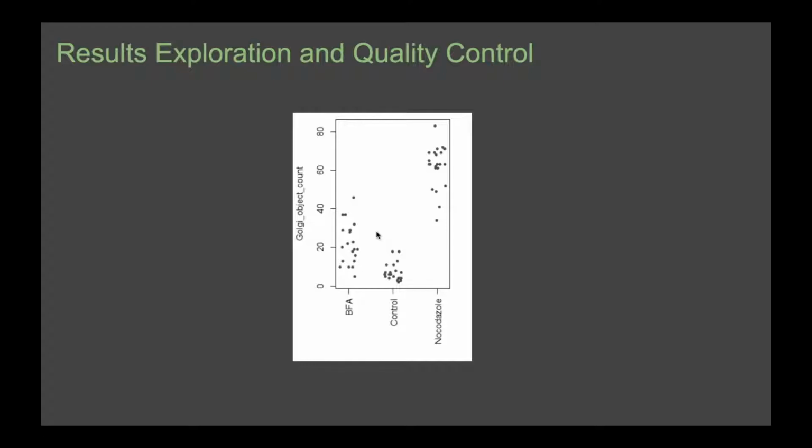Okay. Our next question is, how much knowledge in programming is required to be able to do basic bioanalysis? I think zero, maybe. For example, there are also commercial softwares like Imaris. They are really user-friendly, and also in ImageJ you can do a lot.